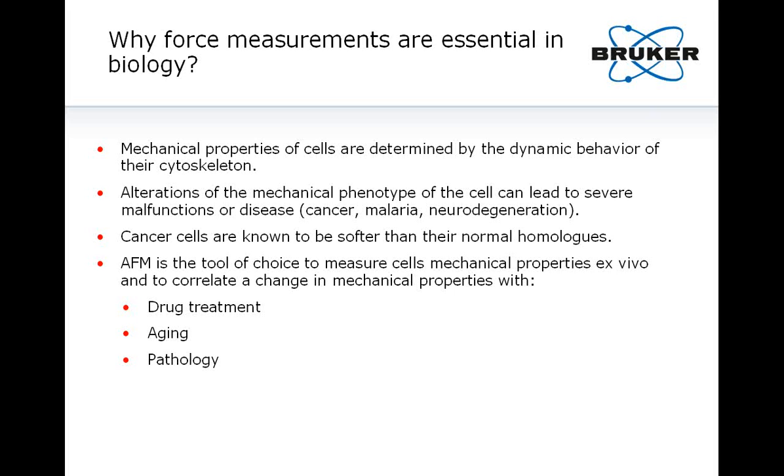AFM is a non-invasive technique, depending on what we call non-invasive, of course, but compared to most of classical approaches like surgery in the case of cancer, it's really a technique of choice to investigate ex vivo cells' mechanical properties, for instance, in response to drug treatment, or correlate them with aging or pathologies.